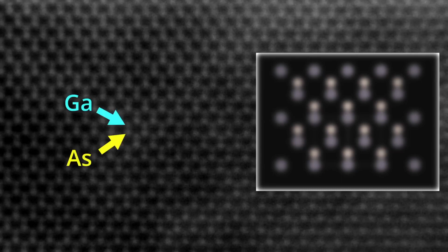We call them dumbbells of gallium arsenide. And in the top, you'll notice that the pattern is actually different. It doesn't have the dumbbells. This is lead selenide, which forms a completely different crystal structure. And what's happening in between these two weird sort of fuzzy blobs that look like dislocations but aren't really dislocations, I think is really interesting, but unfortunately it is outside the scope of this YouTube video.